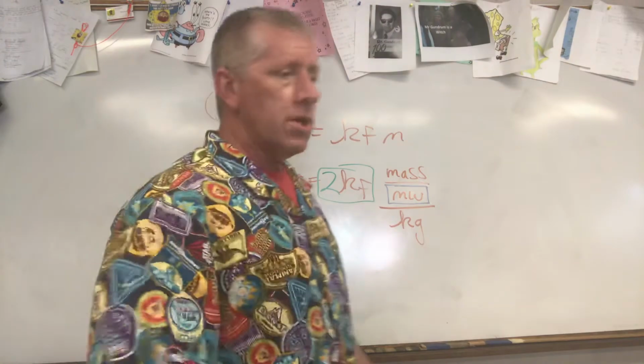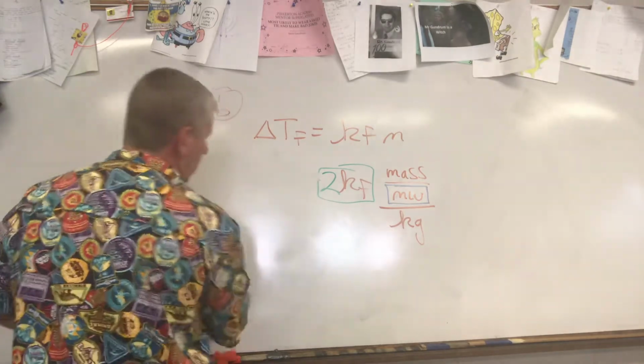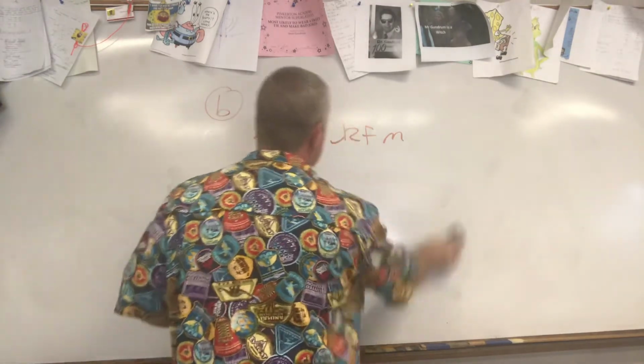Do those calculations, come out with some values. Hopefully we get somewhat close. This is the most difficult lab to do of the entire course. It's the most difficult one to do and come out with decent data. I always tell students doing this, if you can get under 40%, that's not bad, accept that, because you've done all right, because it's a difficult one to do.